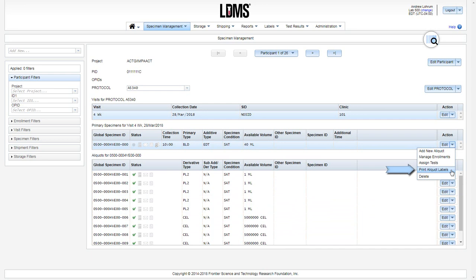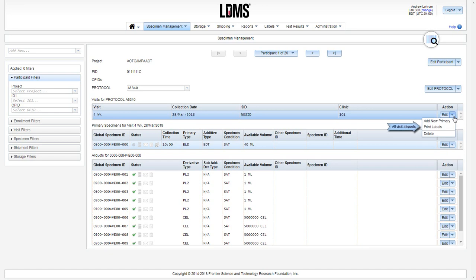In the primary grid, using this drop-down menu and selecting print aliquot labels will generate labels for all aliquots from this one primary. And the last is the visit grid. Using print labels at this level will generate labels for all available specimens from this visit.